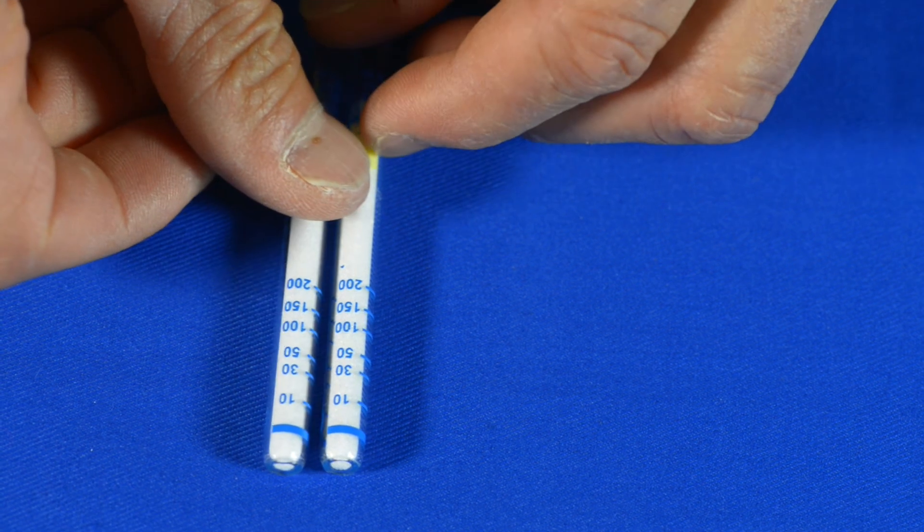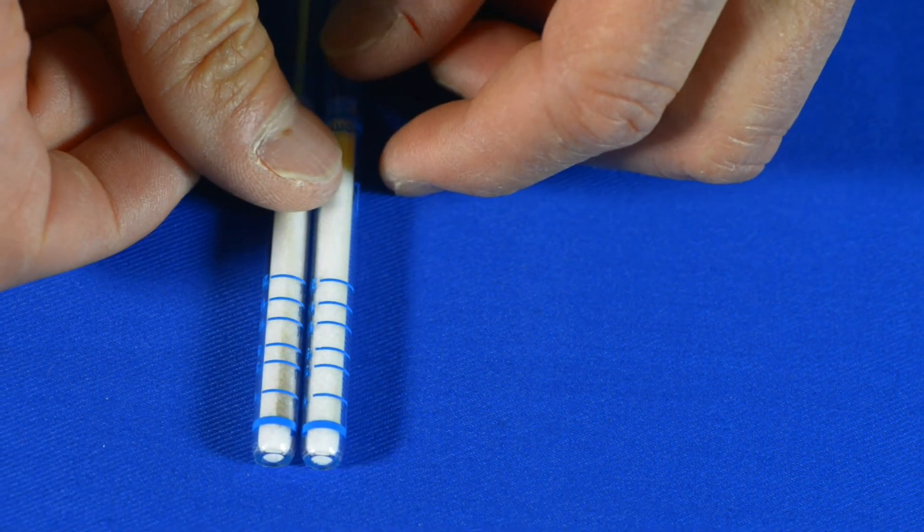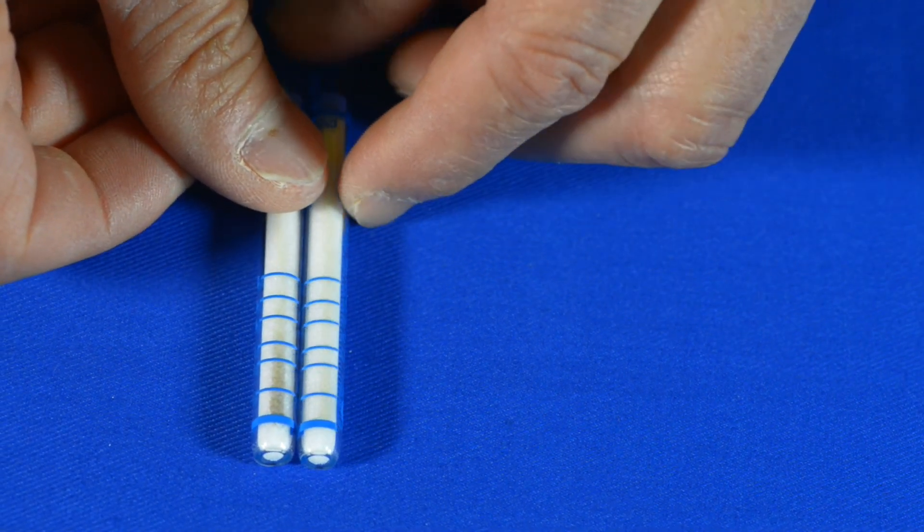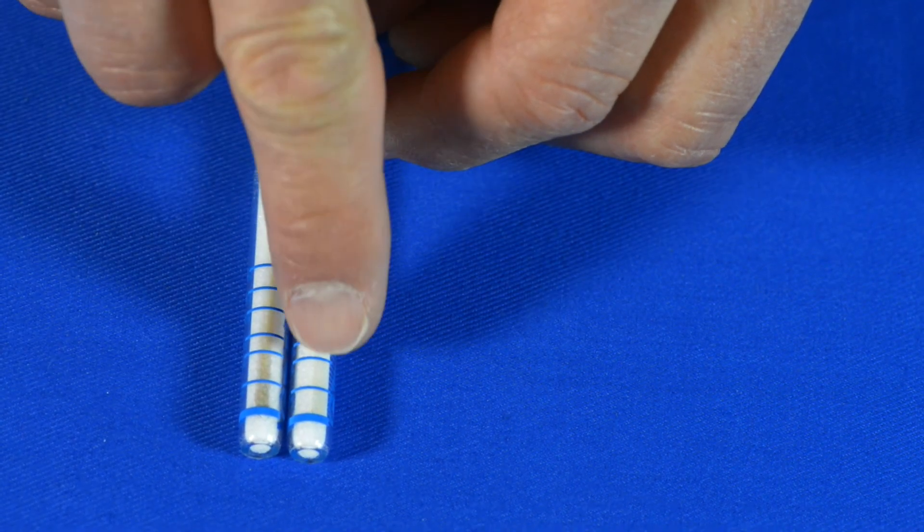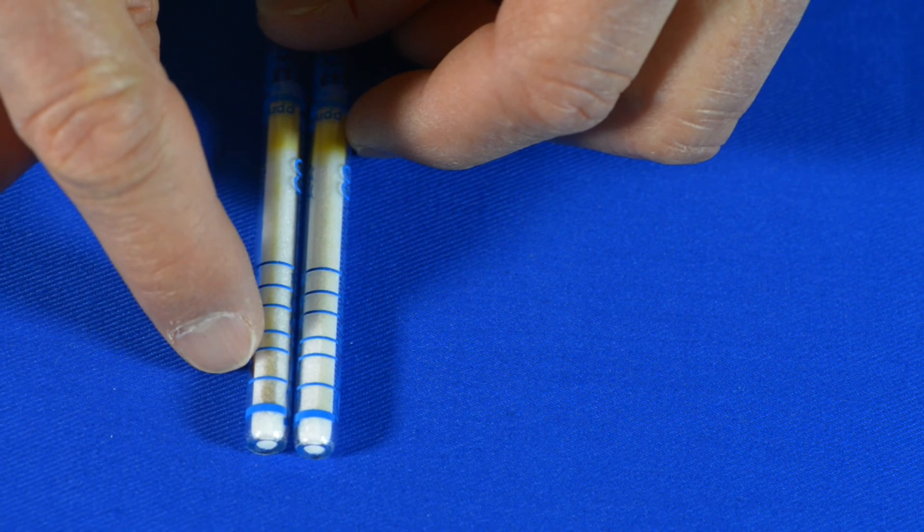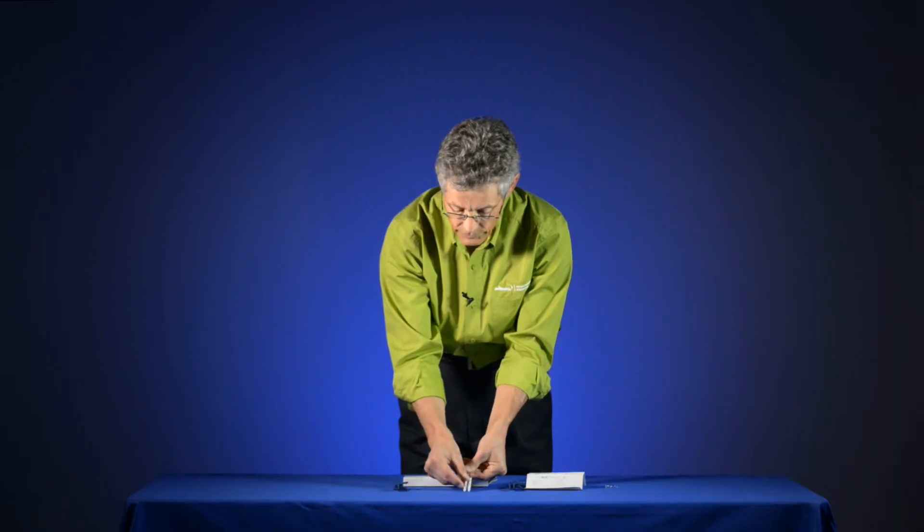You can see the one on my left is still clear, whereas the one on the right has got a darker stain occurring across it. And I want to know how far that stain occurred so I can see it's crossed the second line.